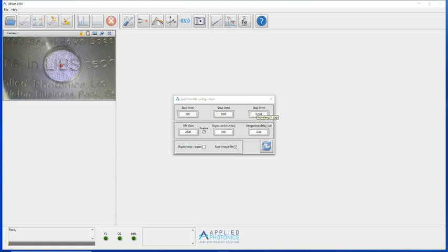Typical values of these parameters are shown, however they depend on the cassette installed in the spectrometer. Details can be found in the spectrometer's user's manual. APL can also provide advice on the parameters that should be used. Once these parameters have been set, they can generally be left unchanged.